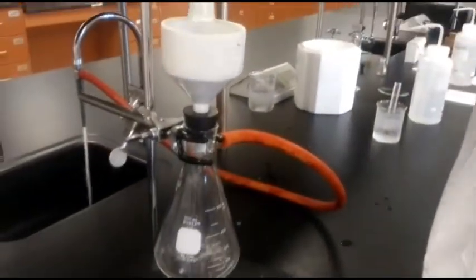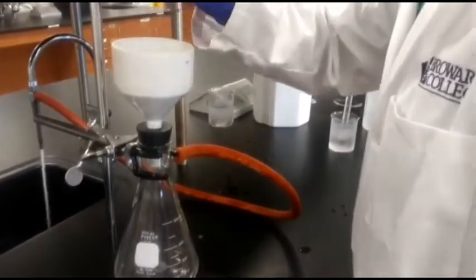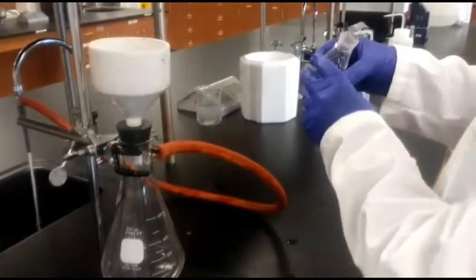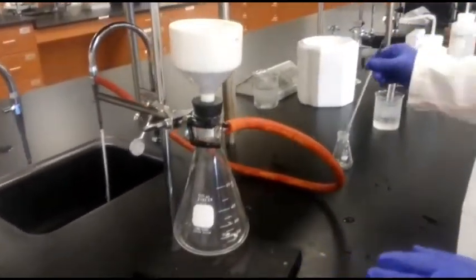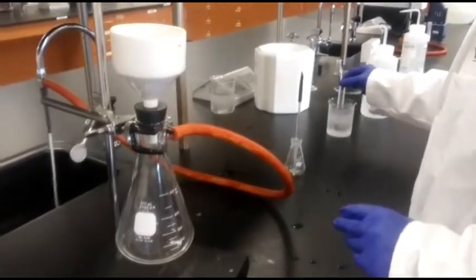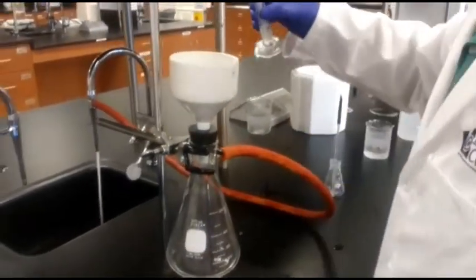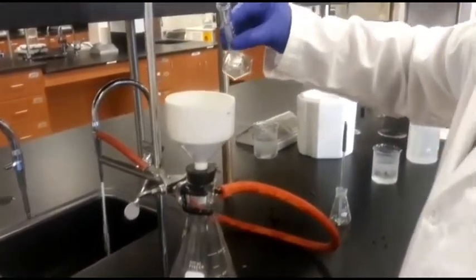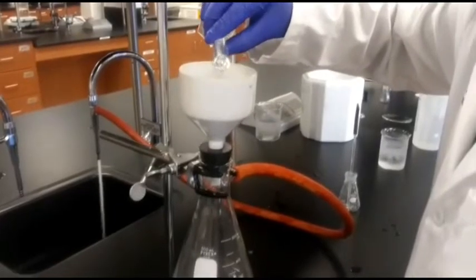So that I will pour it here, okay. All right. Now we can wash this acetylsalicylic acid using a little bit more cold water. It's just the washing, making it more pure.